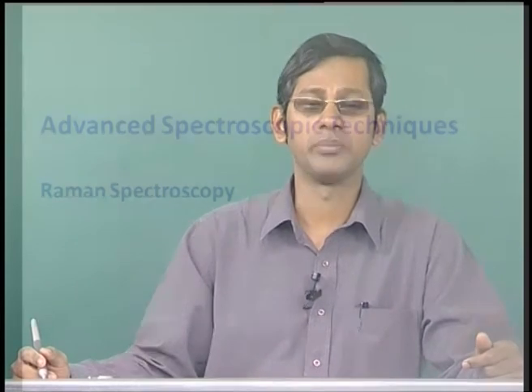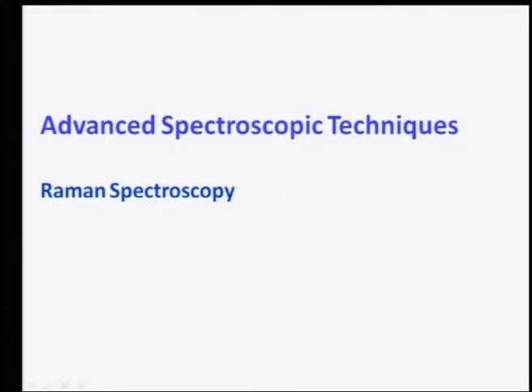In this class today, we are going to discuss a very important spectroscopic technique called Raman spectroscopy. And as you know, Raman was an Indian, and a lot of important aspects are involved in relating to this spectroscopic technique. So, I will be able to do a little bit of justice to this in 1 hour time.